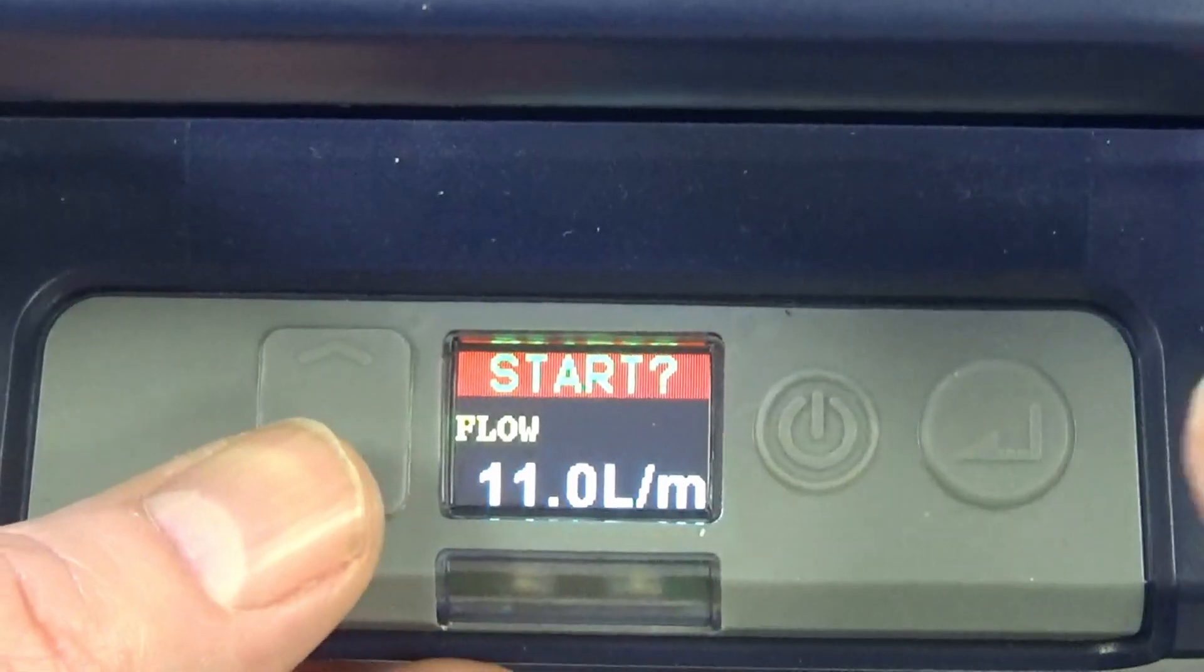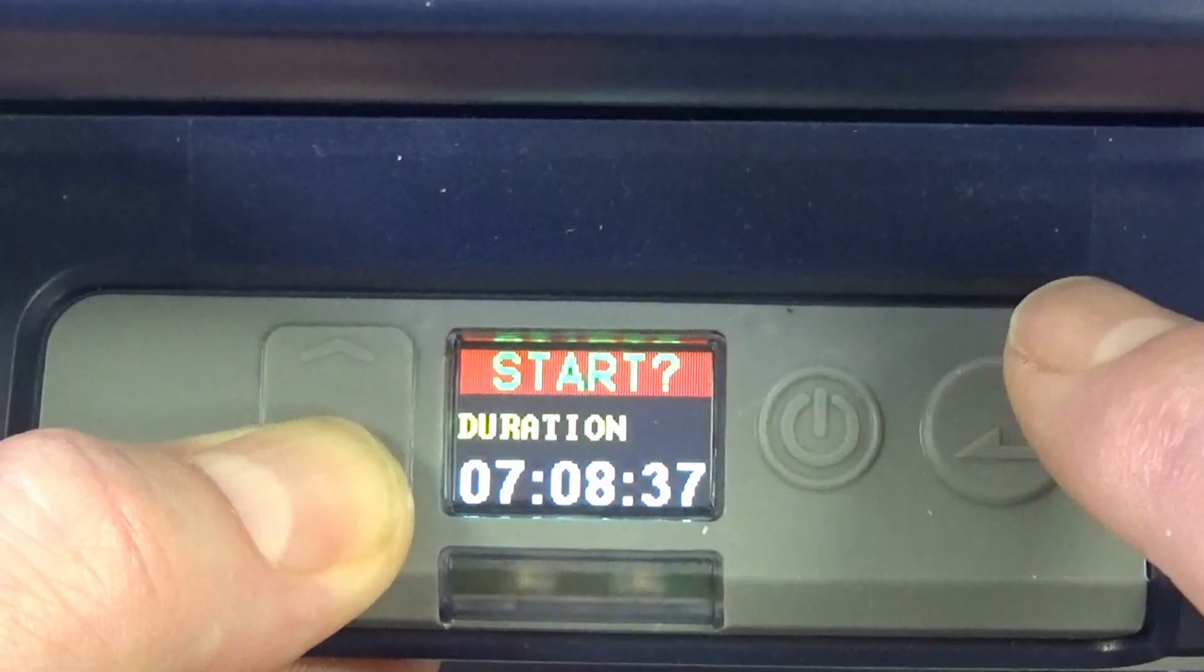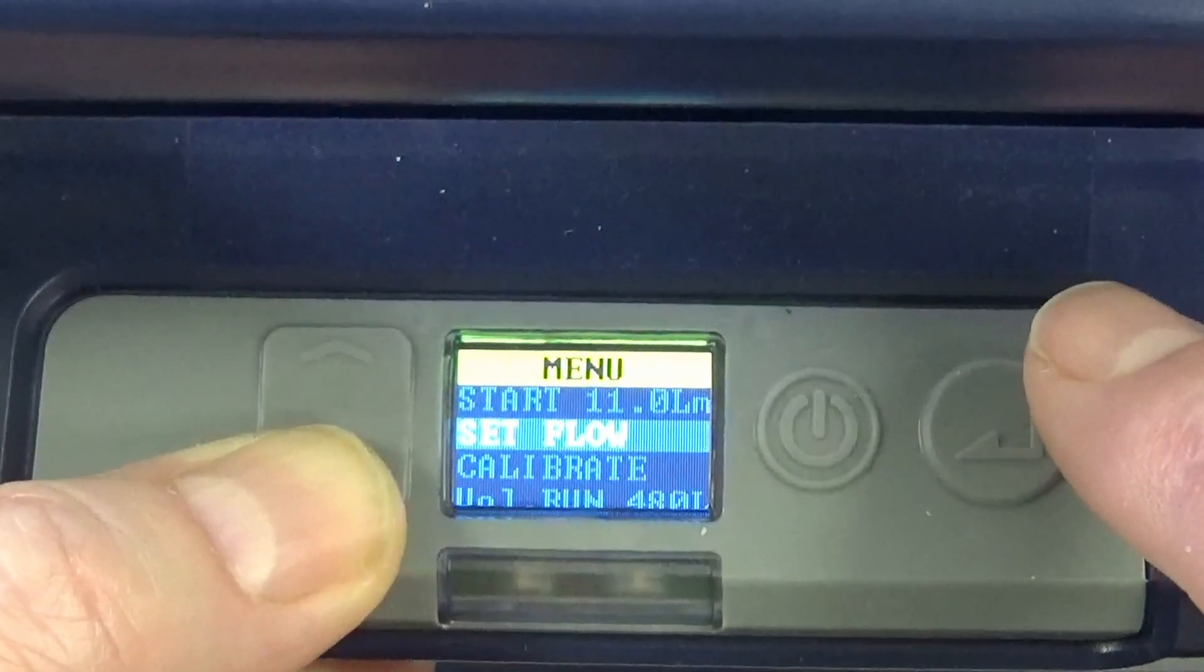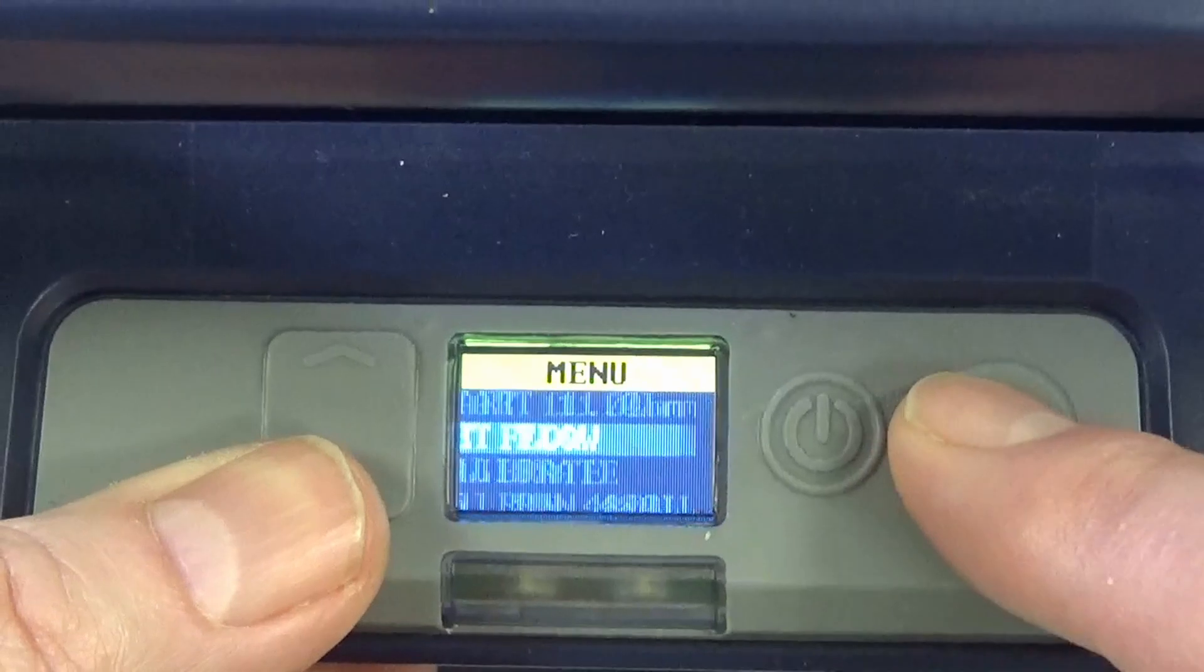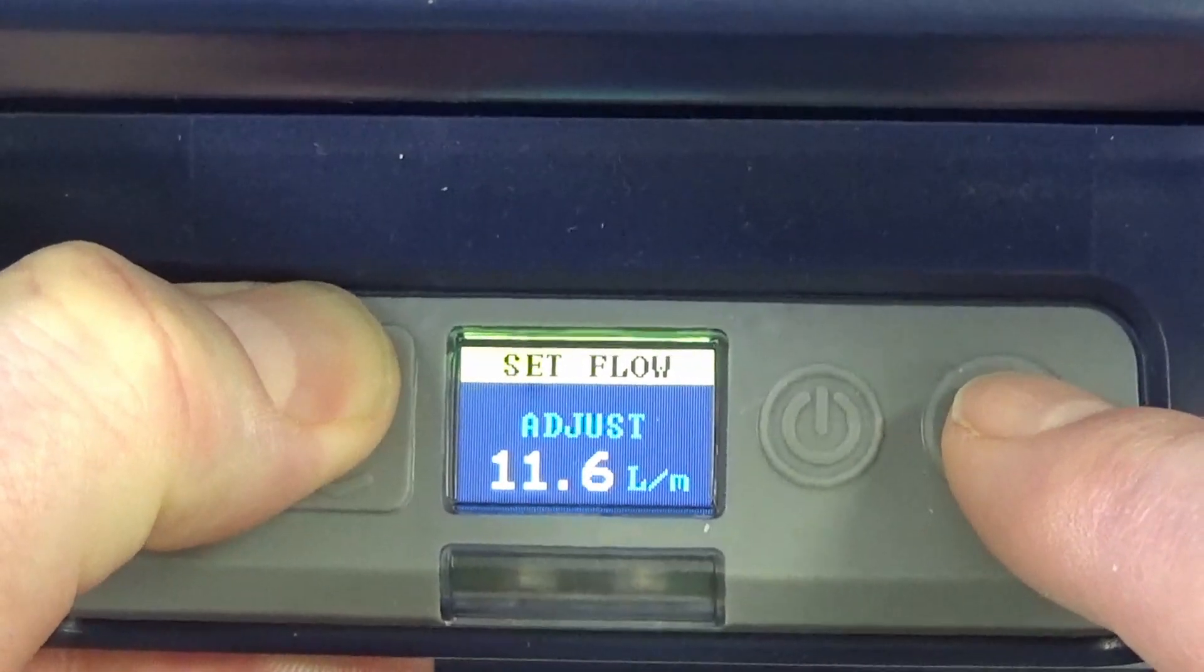To set the required flow on the pump, press the down cursor to access the menu. Select set flow and set the desired flow rate. In this case it is 12 litres per minute.